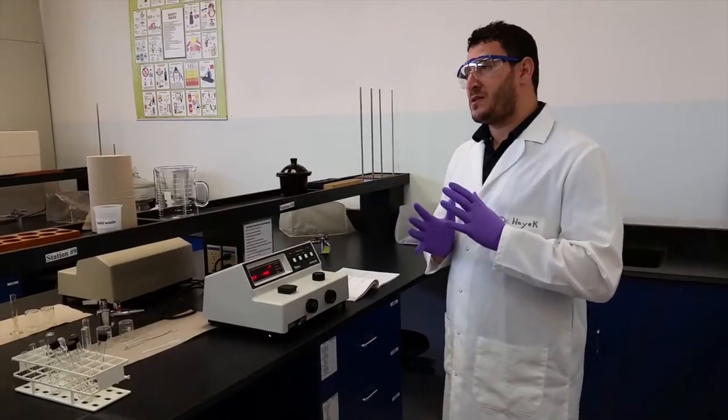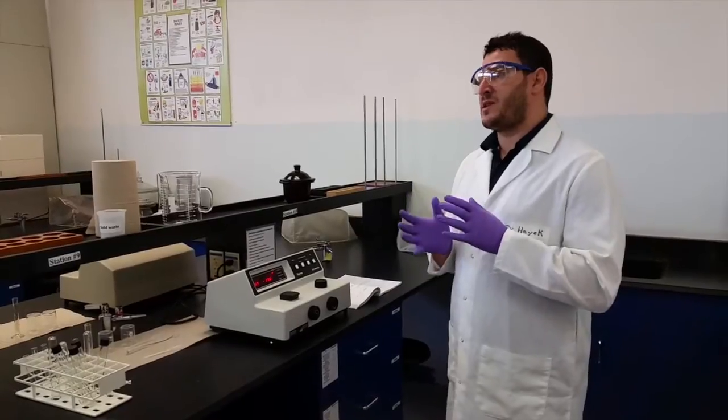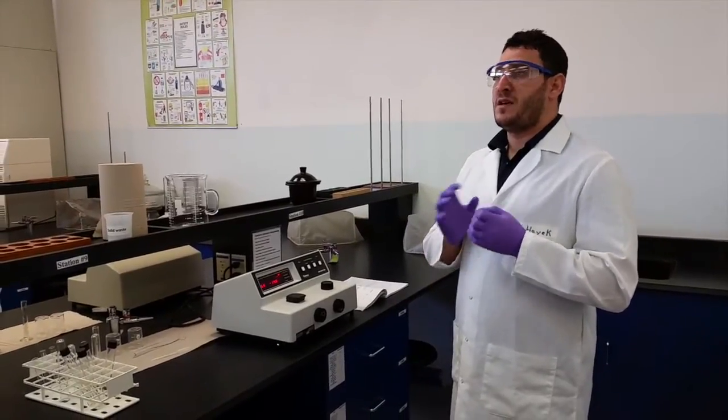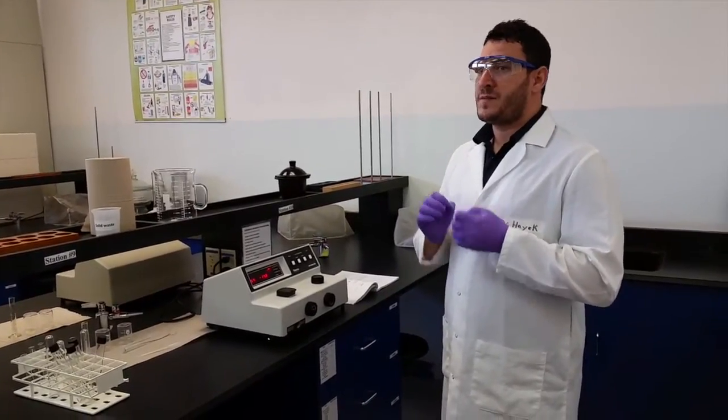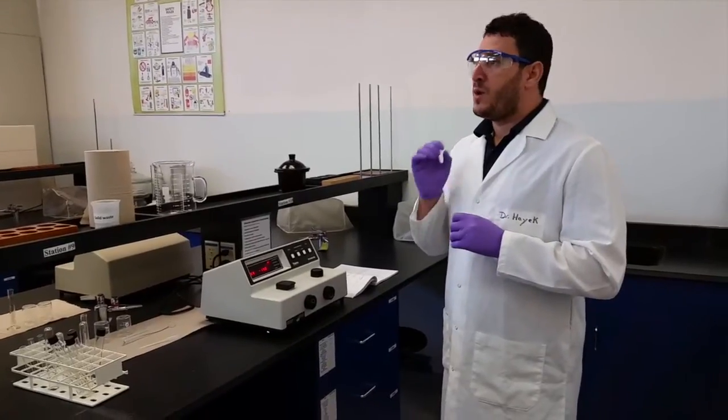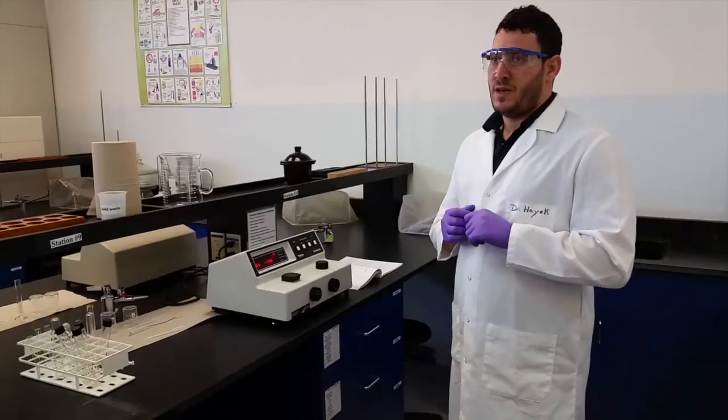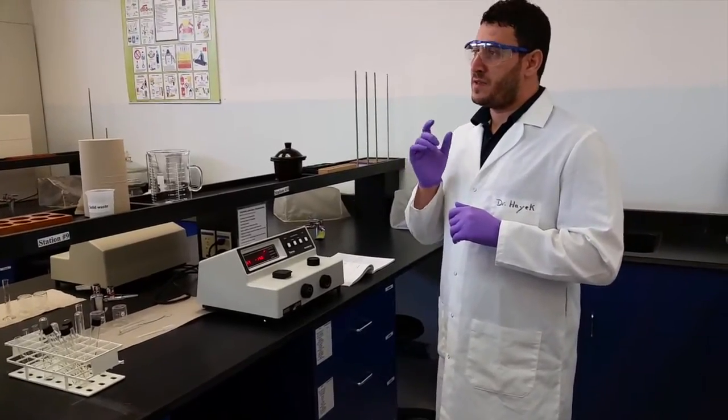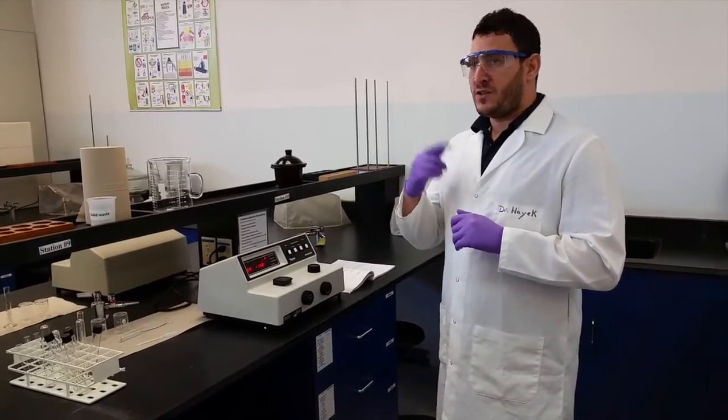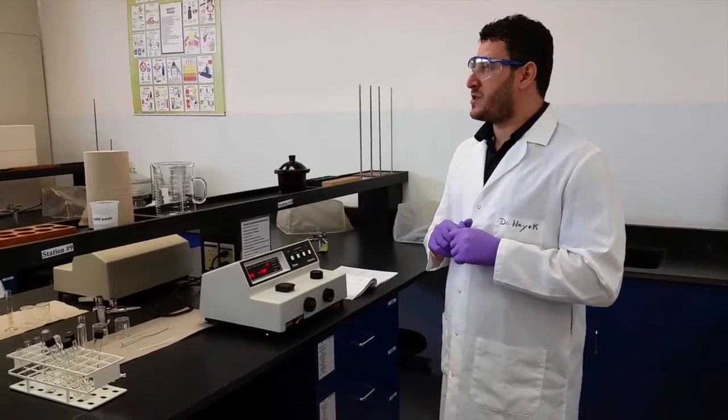From this we understand that the species that absorbs light in this equilibrium is Fe(SCN)2+. When we measure the absorbance of the solution, we are measuring the absorbance of this species, and therefore we can determine its concentration in our mixture.